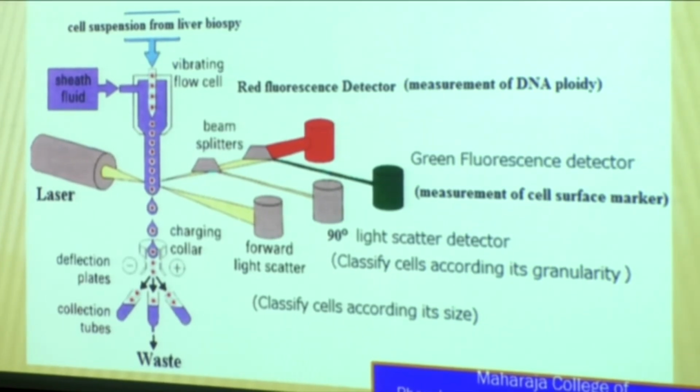But you need a technique to determine how many cancer cells are present and how many normal blood cells. Flow cytometry is a powerful technique based on luminescence, which you can apply for that. This is an instrument available in diagnostics. Many diagnostic centers have it. When you go there, they will use this flow cytometry to determine the number of them.